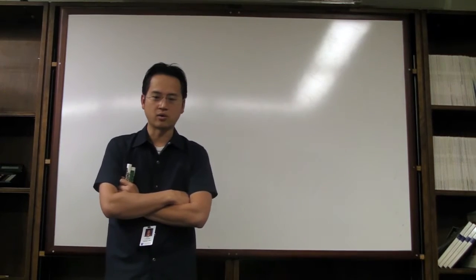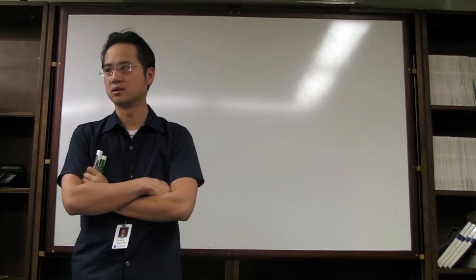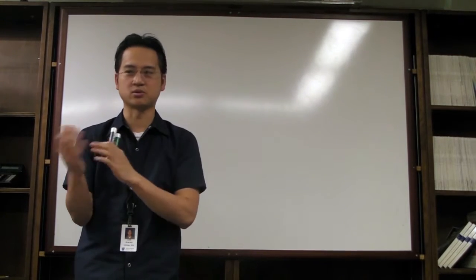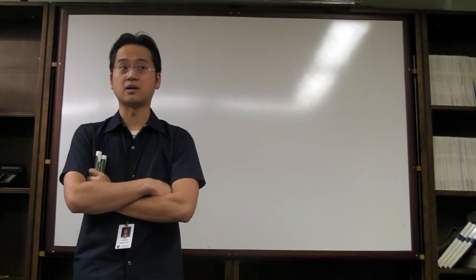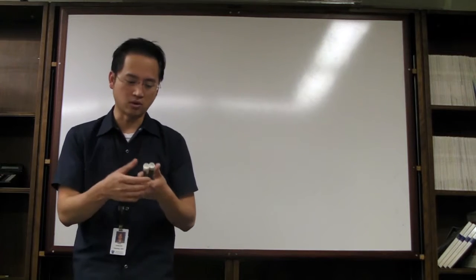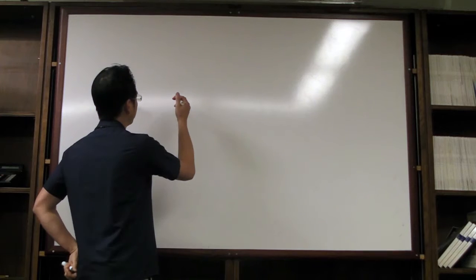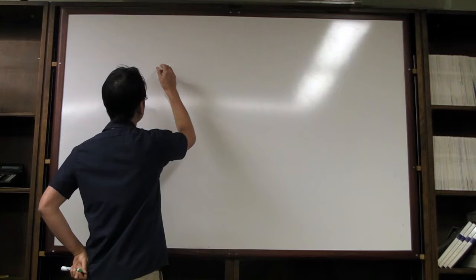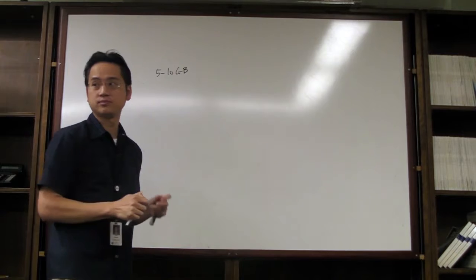So with that, let's say we do our 500 gene capture panel and we send it off for sequencing. Alternatively, you can have a sequencer in-house as well, so that's another debate, insourcing or outsourcing of sequencing. We send it out, and within 10 days, 2 weeks, we get the data back. Typically for a 500 gene panel, depending on the coverage that you get, you might get back anywhere from 5 to maybe 10 gigabytes of information.